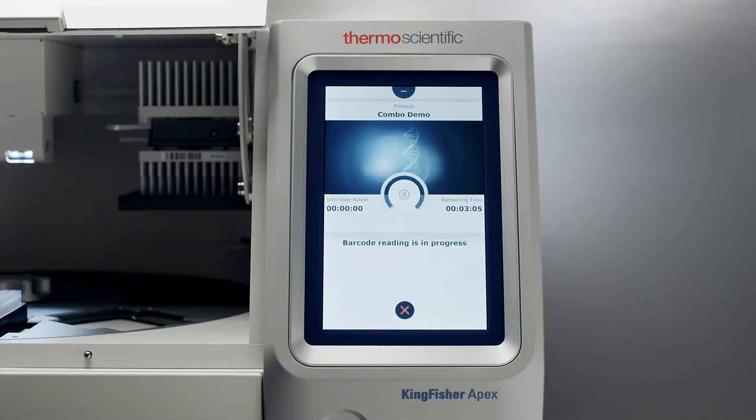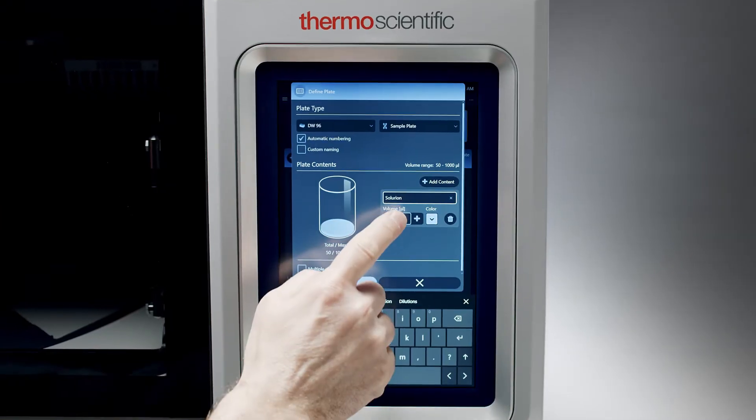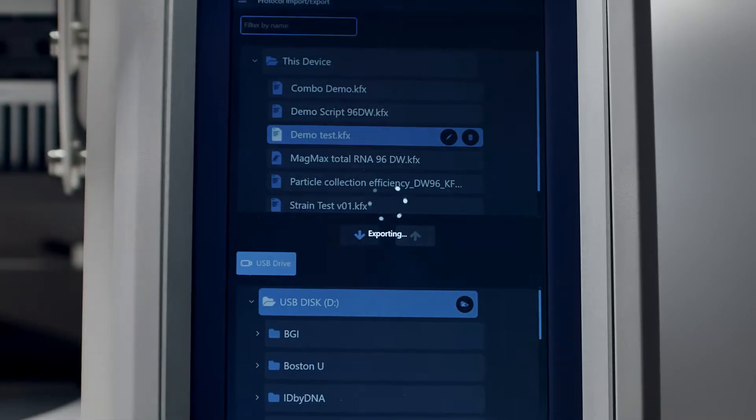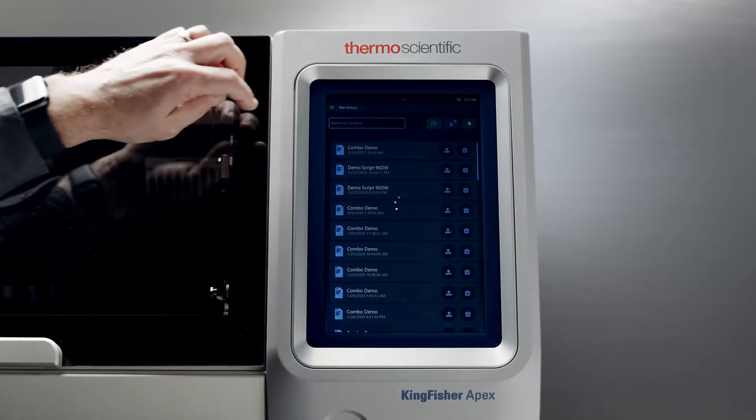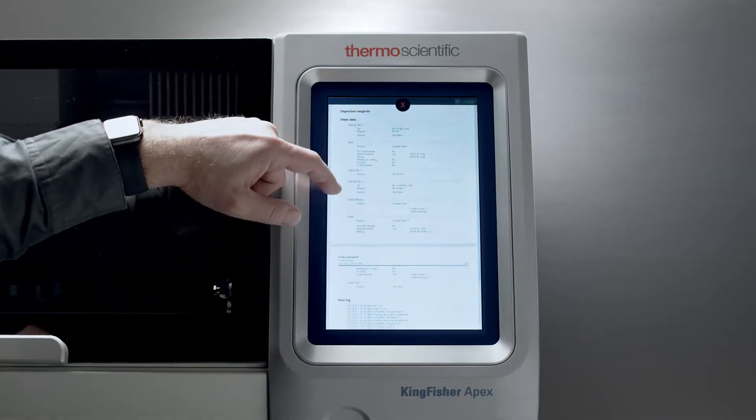Or you can work from your PC. Download the software, edit your protocols, and transfer them back. When it's done, generate run reports in PDF or XML format.